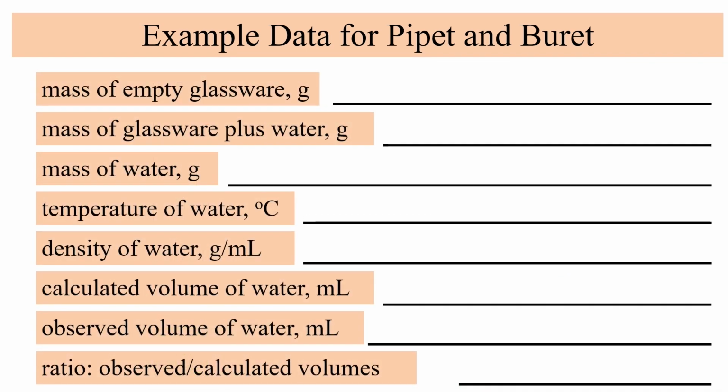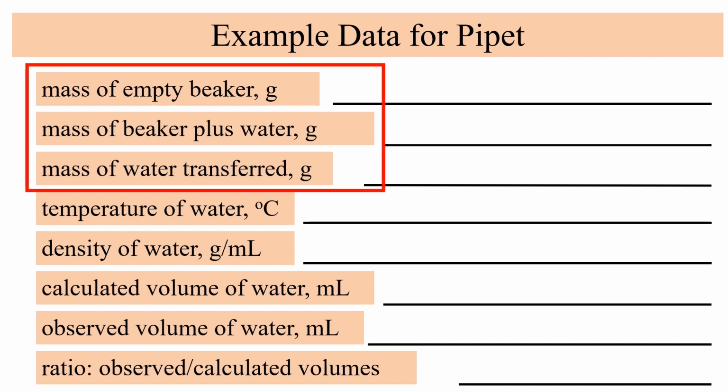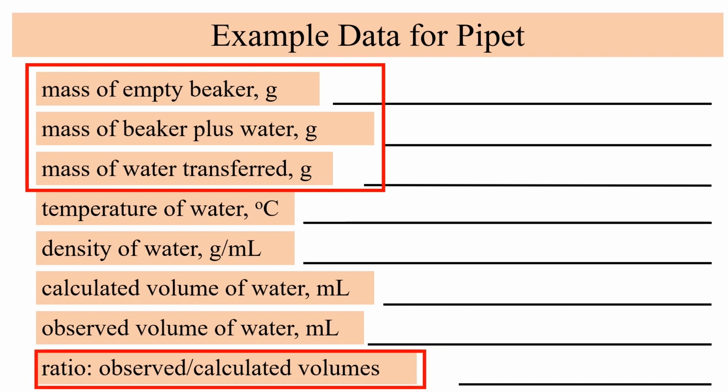For the pipet portion of this experiment, we'll make this subtle change. The mass of water transferred indicates the mass of water transferred from the pipet. Also notice, our lab asks for the ratio of the observed and calculated volumes. As you'll see, our pipets deliver a specific amount. They only have one graduation. Now let's take a look at the data collection for the pipet.